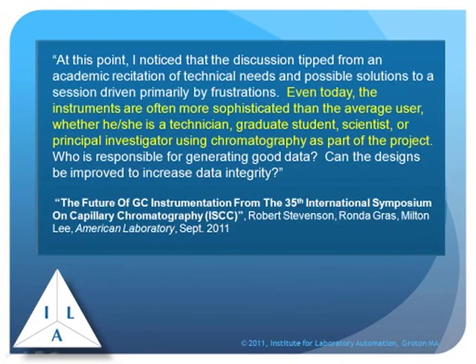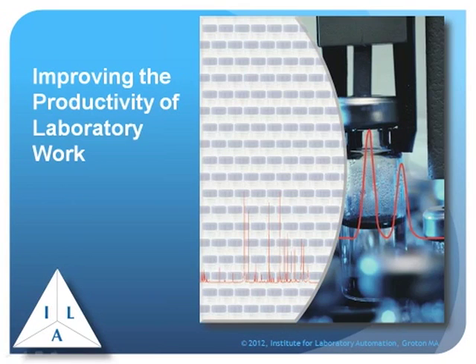There was a meeting held in Hamburg in May of 2012 where a vendor stood up and gave a presentation talking about their equipment, but also talking about the kind of problems they encountered as they went from one laboratory to another. This was liquid handling equipment, and people were getting erroneous data, not because there was anything wrong with the equipment, but because they hadn't been calibrated properly. The volumes were off, the dilutions were off, and the results were junk, simply because they didn't use the equipment properly. So if we're going to get into the area of informatics and looking at these types of systems, we have to make sure that people are properly trained.